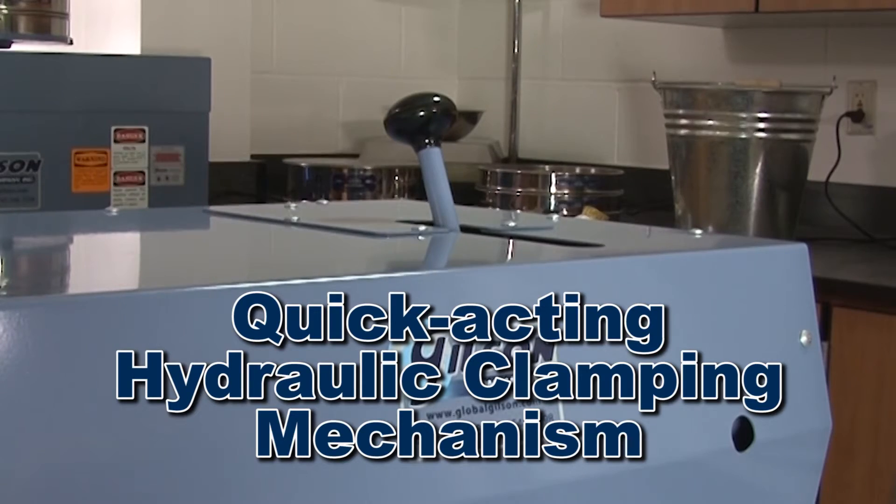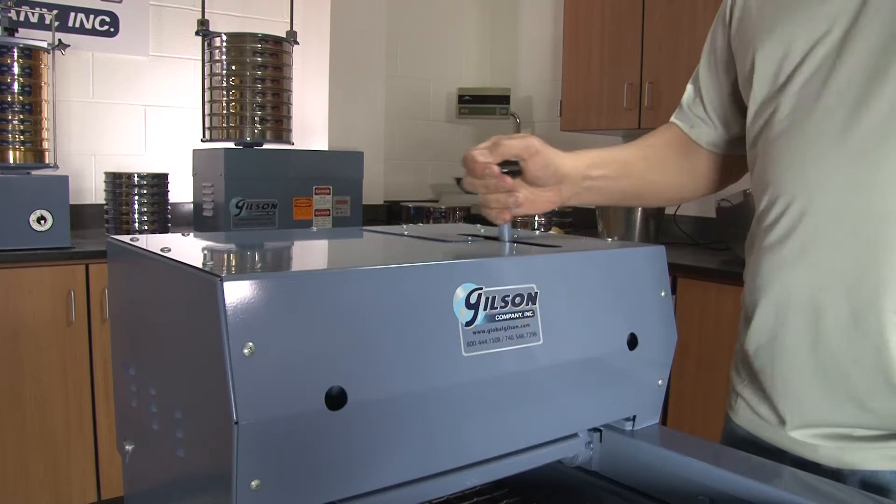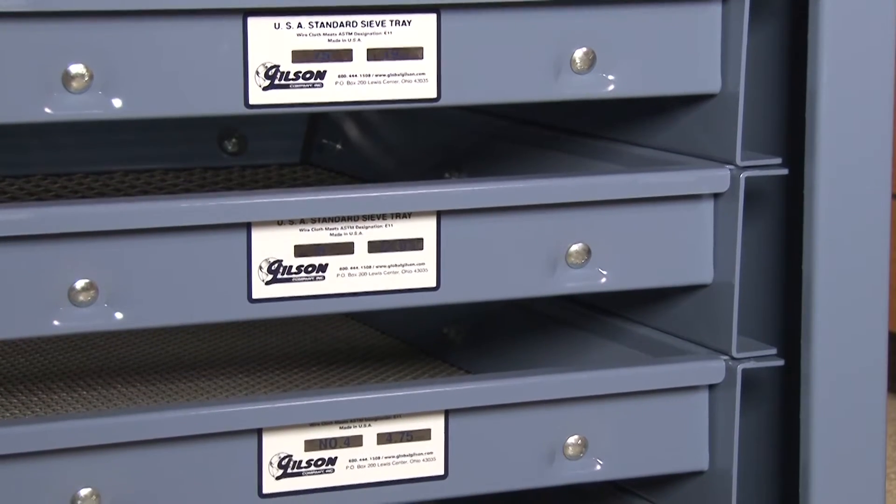The TS1 has a quick-acting hydraulic clamping mechanism, and with a few strokes of the hydraulic pump handle, the screen trays are effortlessly secured and ready for testing.